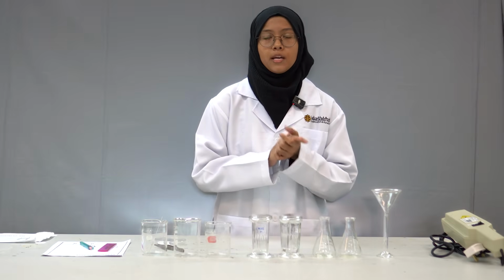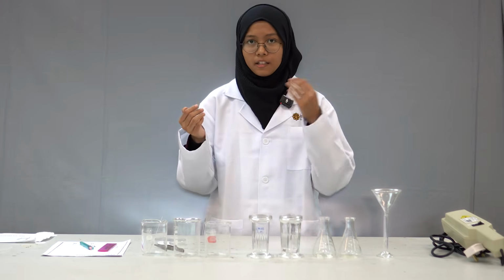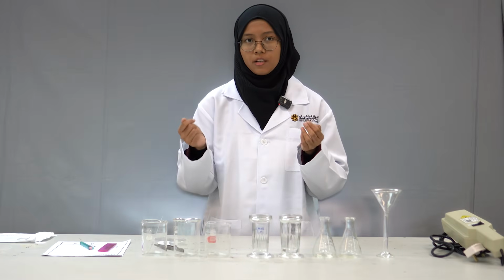Okay, Bismillahirrahmanirrahim. For the introduction, thin layer chromatography is a chromatography technique to separate compounds of a mixture based on their polarity and the attraction between the compound and the two phases. So in this experiment, we have two phases.